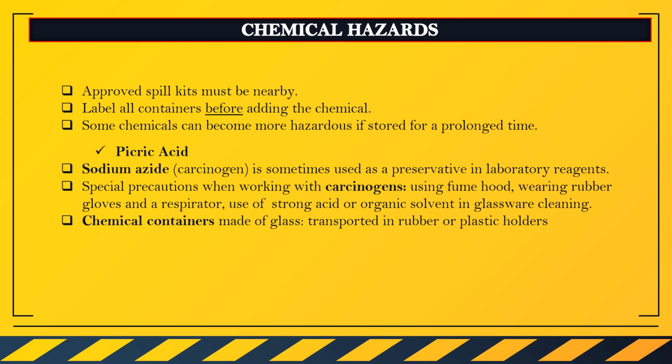We also have sodium azide, which is carcinogenic in nature and is sometimes used as a preservative in laboratory reagents. When disposed down the drain, the accumulation of copper and iron salts will become mechanical shock sensitive agents that can trigger an explosion. So it is important to always read the labels of the reagents, and also the proper protocol and procedures of the laboratory when disposing of this kind of chemicals or agents.